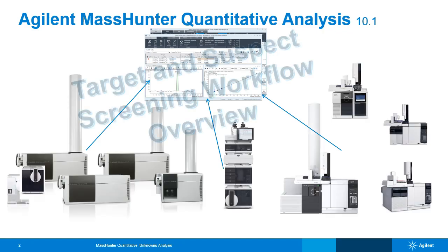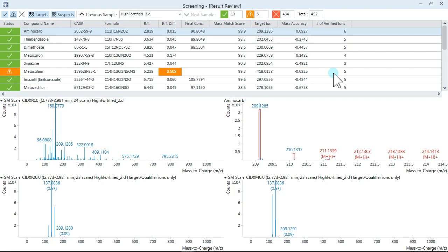to target and suspect screening workflow over. Let's just jump right in and take a look at the screening interface for this sample.